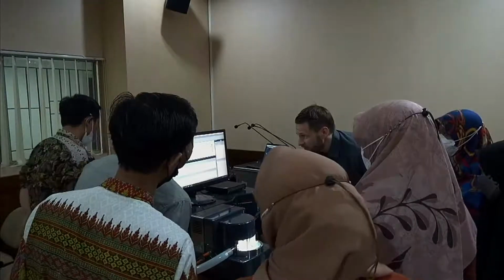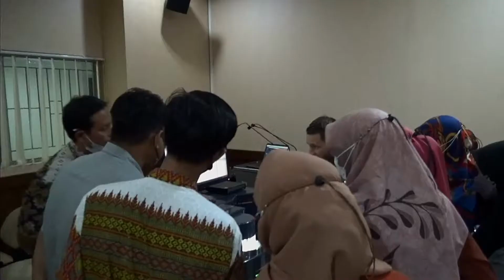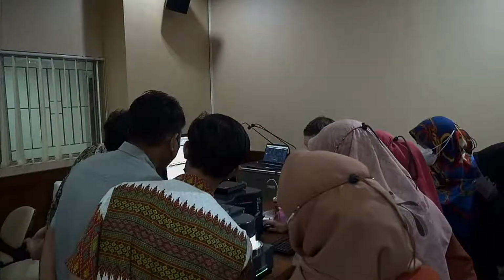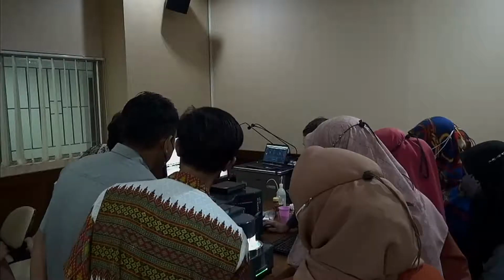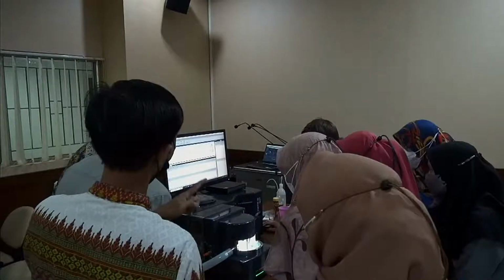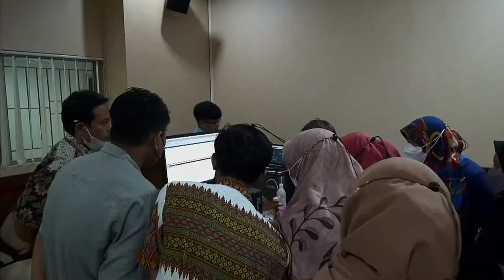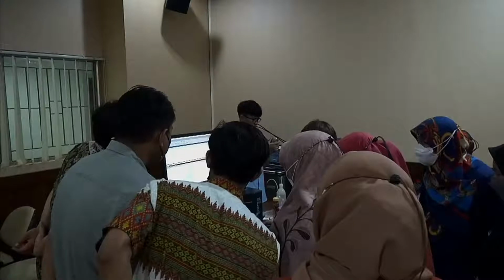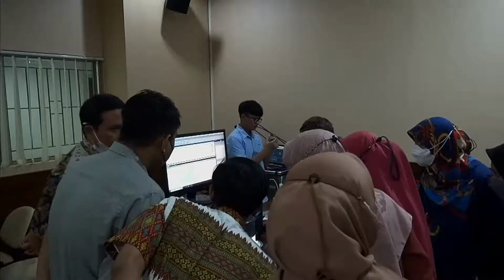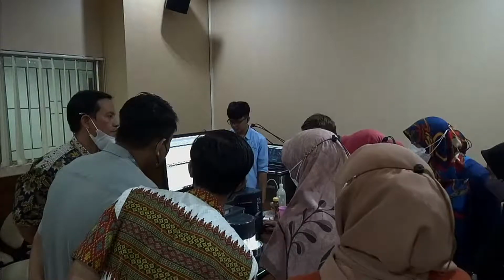Did we actually watch the coconut results? We did not watch the coconut results. So let's look at the first consecutive measurements as well, pretty stable. It's about 8 micrometers in the D50, so 2 micrometers on the D10. I'm pretty sure that the fat content is here, and most of this stuff is solids, which we measure. I'm not an expert in coconut, but it would be my idea when seeing this.